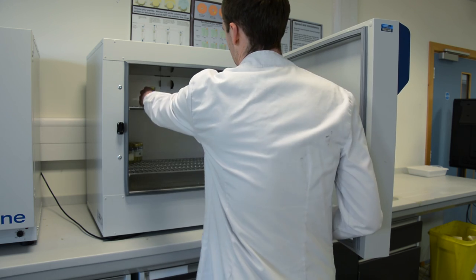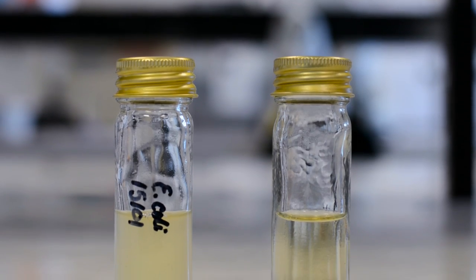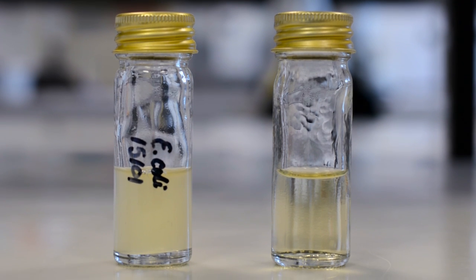After appropriate incubation, a broth will appear cloudy or turbid. If a broth remains transparent, it means that the microorganism hasn't grown.